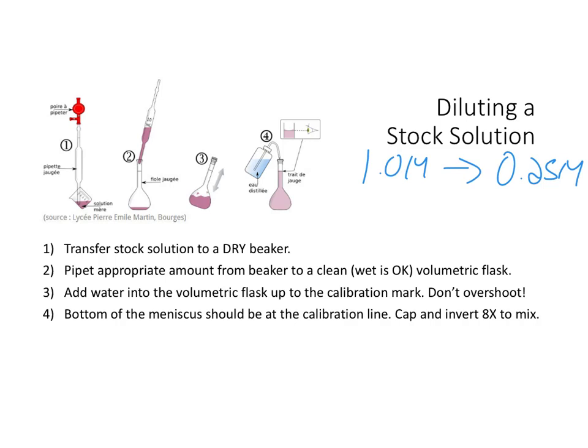So after your stock solution is in a dry beaker, you need to pipette the appropriate amount of stock solution into a new volumetric flask that is clean. It's okay that it's wet, but it's essential that it is clean.